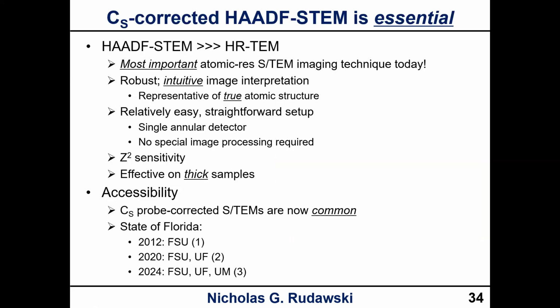Okay, so CS-corrected HAADF-STEM is essential, okay? HAADF-STEM, as of today, is now the most important atomic res STEM imaging technique. So even though I told you that high-res TEM is the most important in terms of being essential, HAADF-STEM is more important in terms of its importance today, overall, technologically speaking, okay? It gives robust, intuitive image interpretation that is more representative of your true atomic structure.